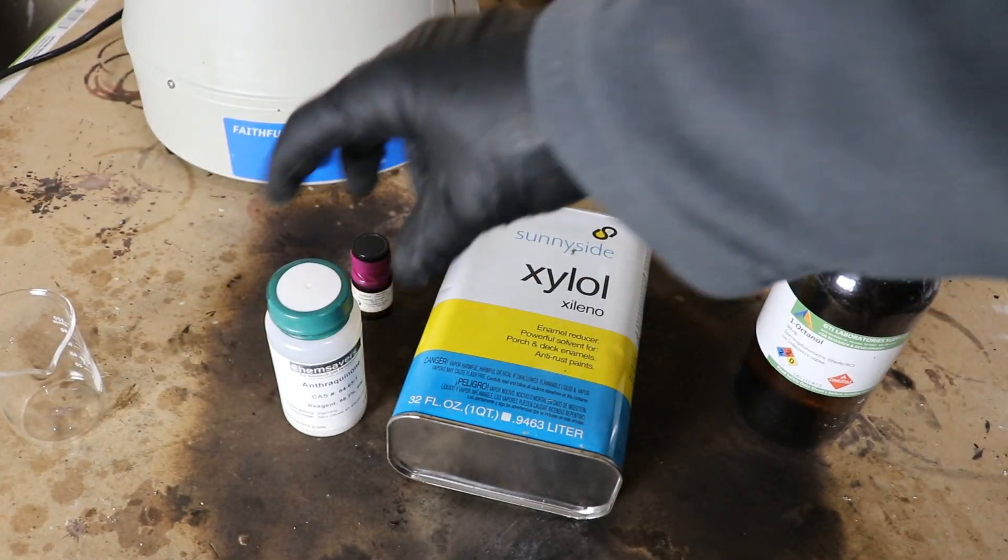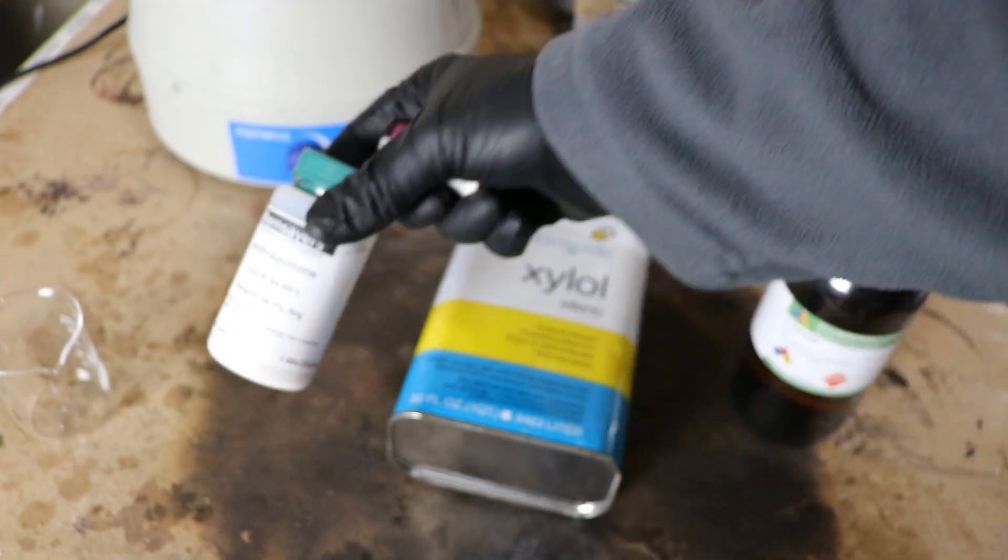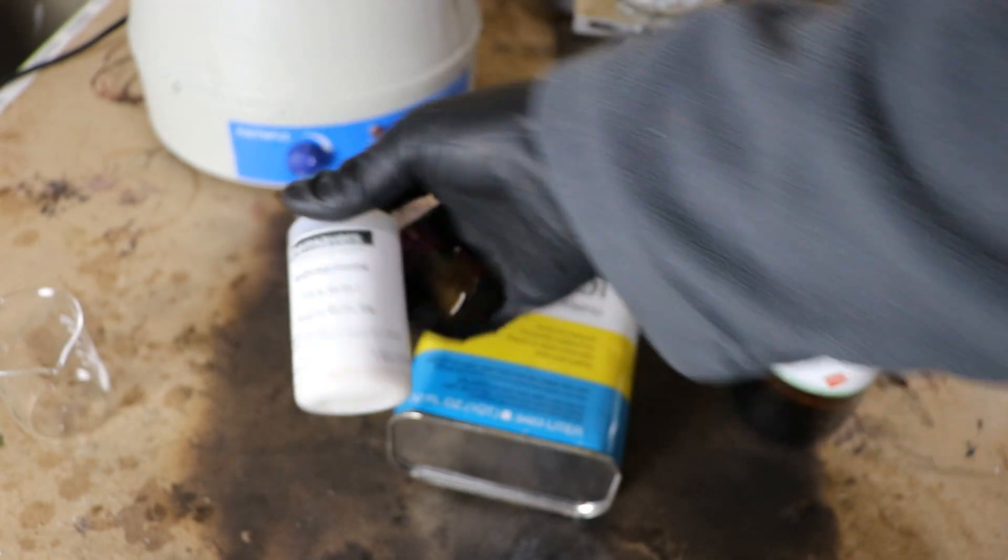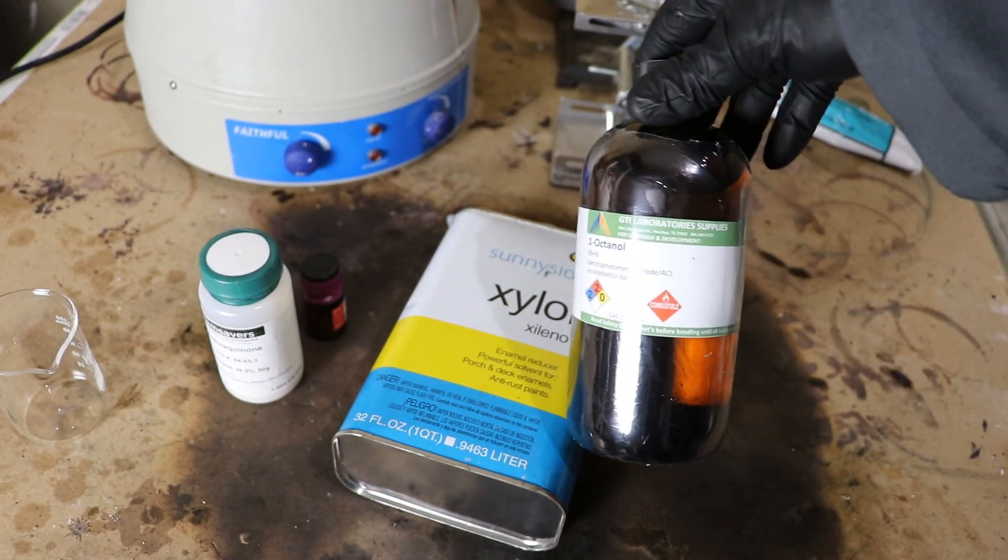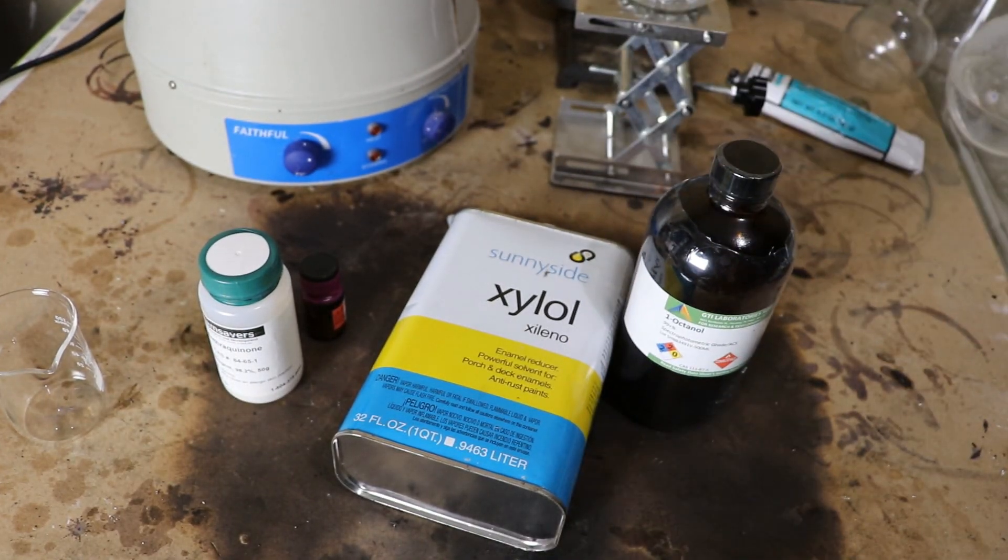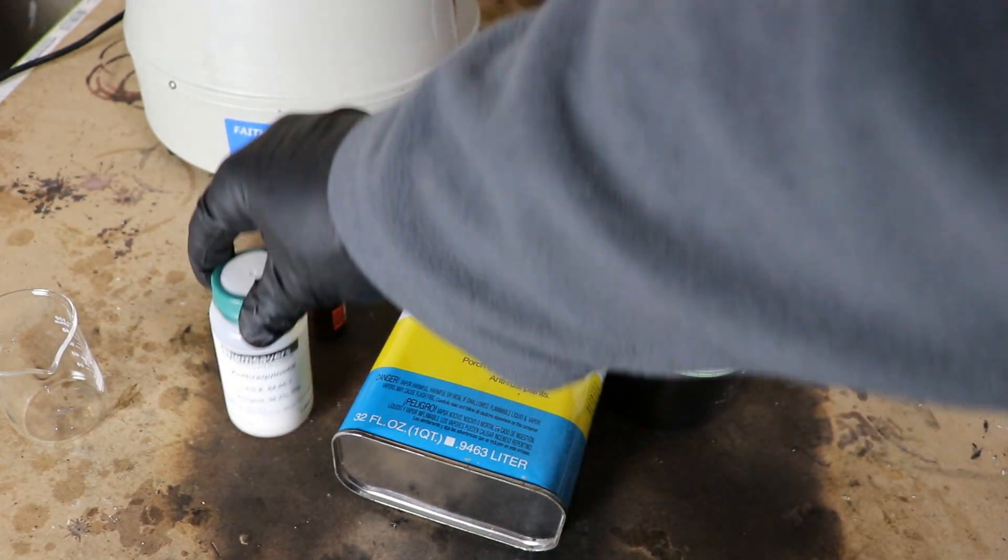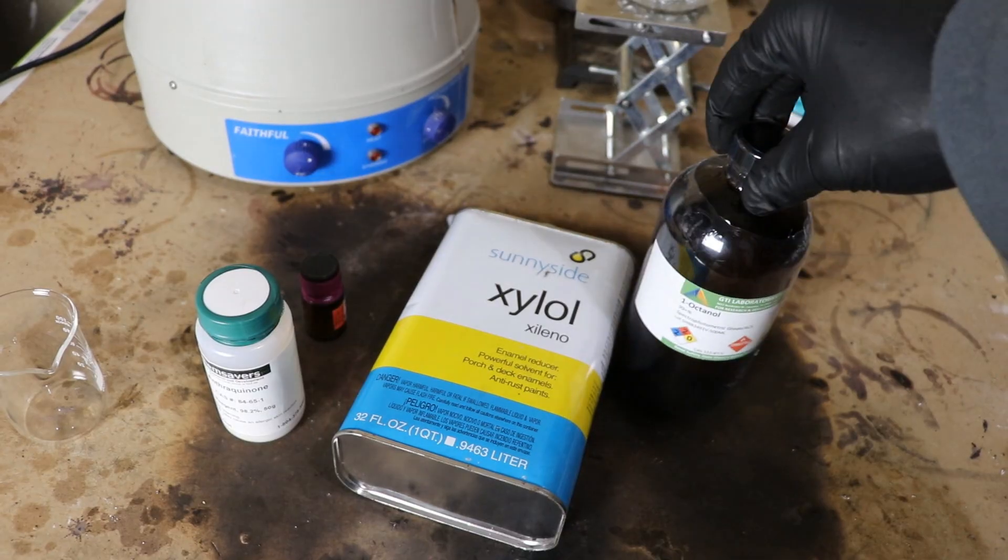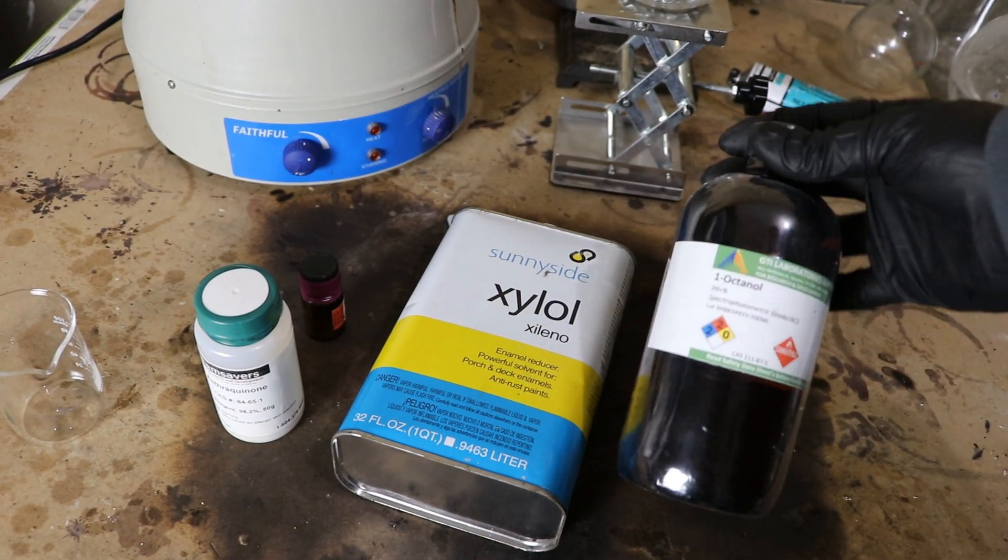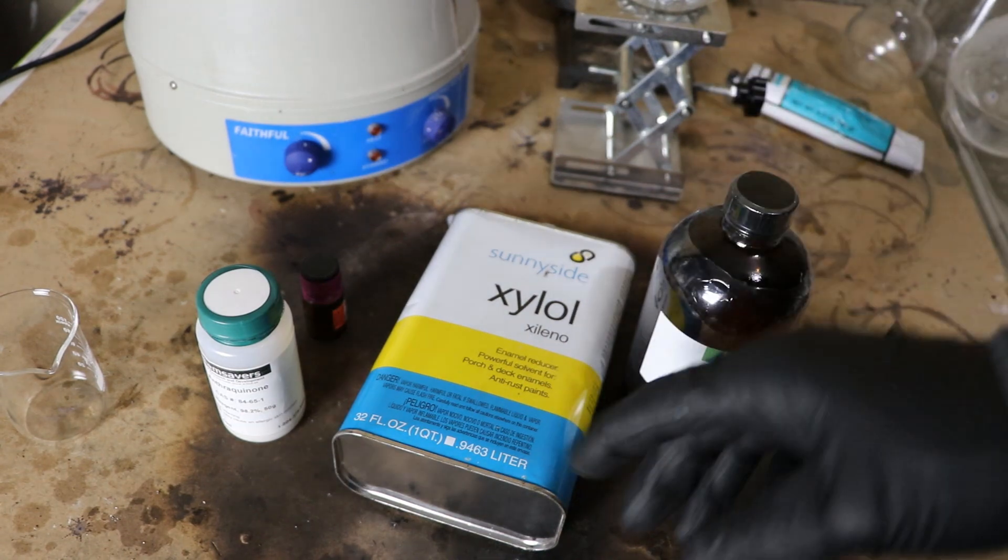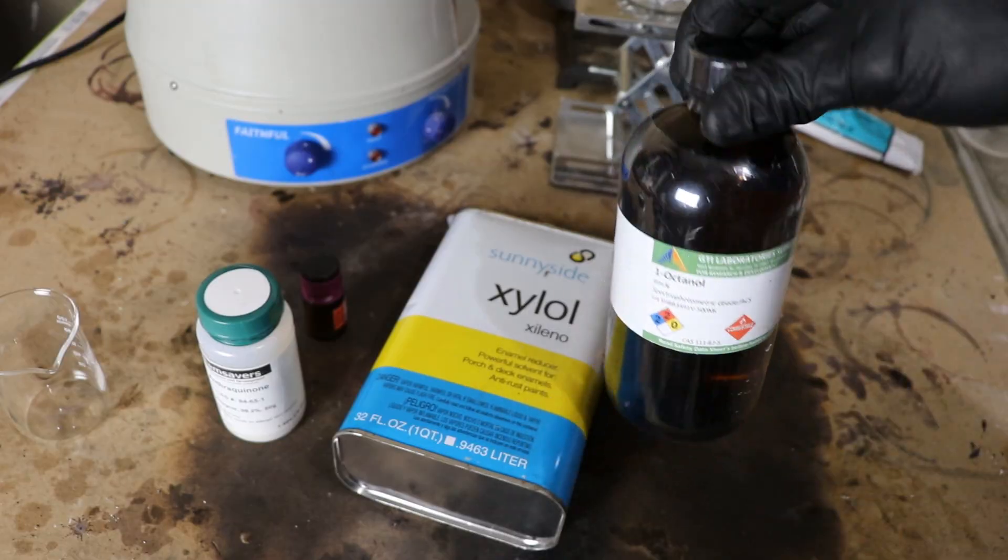So I need the anthraquinone of course, palladium to aid in the catalytic hydrogenation of this, and a couple of organic solvents. This is some xylol and some octanol. Nonpolar to dissolve the anthraquinone and polar to dissolve the hydrogenated anthraquinone. Now I think I could use a lower order alcohol such as methanol or ethanol, but I also need something that doesn't dissolve well in water so I had to use the higher order octanol.